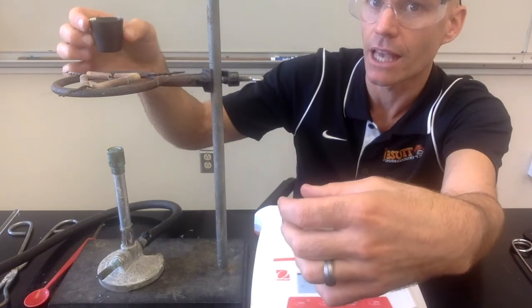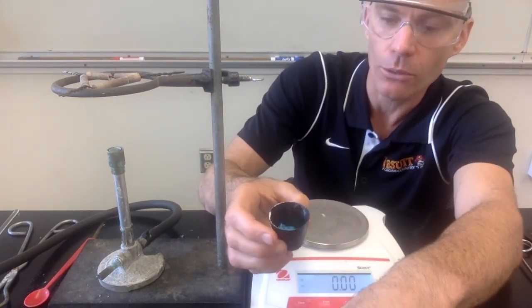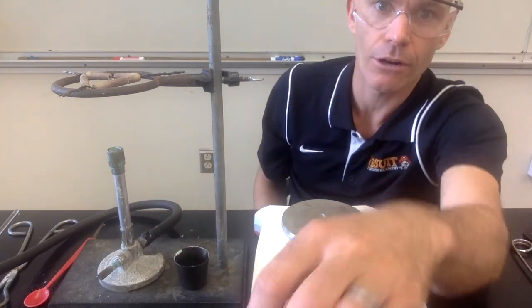It's a reversible reaction — we can go back and forth. We can heat this again and drive the water out, then add the water back in, and do that multiple times. So that's it. Good luck on the rest of the lab.